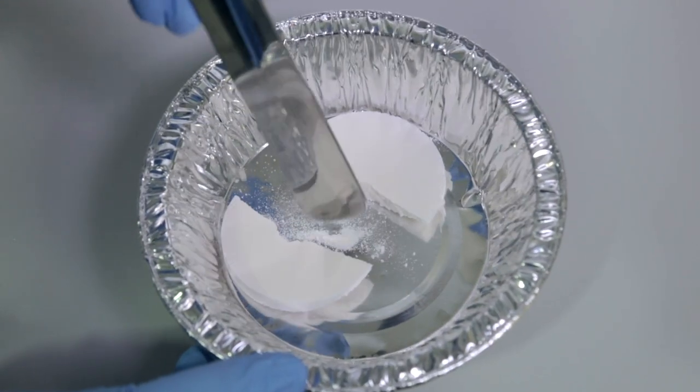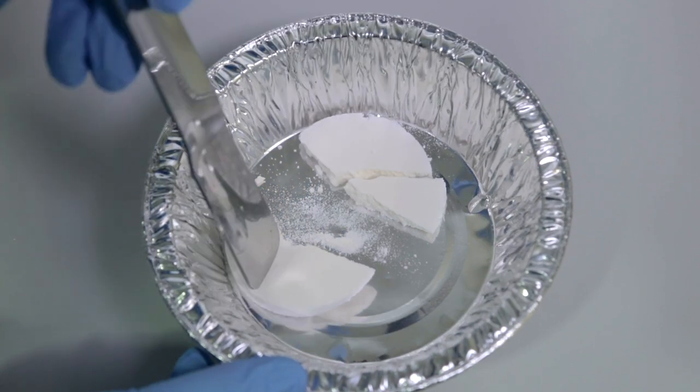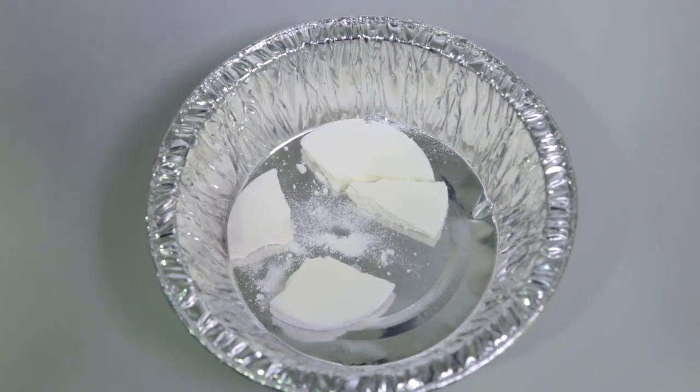The result is a caked powder with a substantial mechanical strength, and we can see that imposing quite a large force on this caked compact actually causes it to break and fracture, but not back into its primary independent particles but indeed still strong agglomerated components. The result of this if it happens in processing is that you can have blockages, stoppages, material that you can't get out of your storage equipment, and it's transformative in terms of the downstream functionality of the powder.